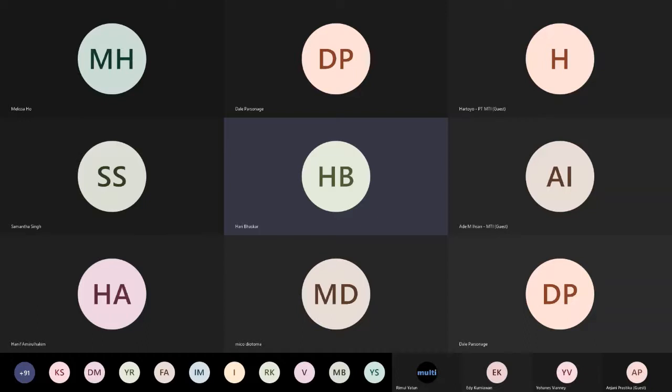on the day of the calibration. And then you measure this monitor every day, and it collects the count rate on that particular day. It then compares with the original count rate on the calibration day. It calculates a ratio and uses that ratio and corrects the raw count rate of your routine samples.